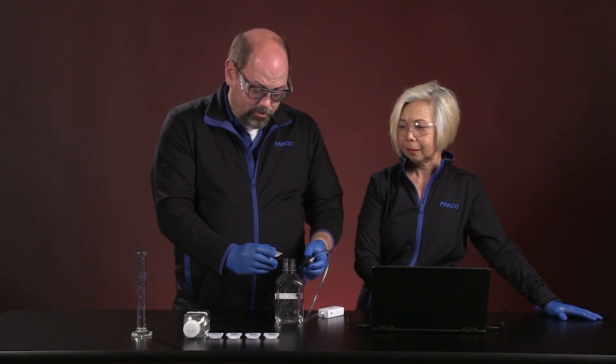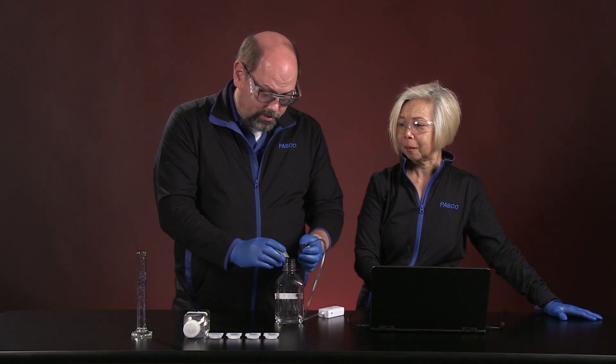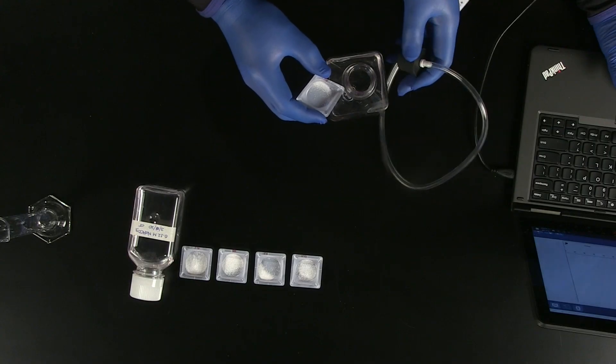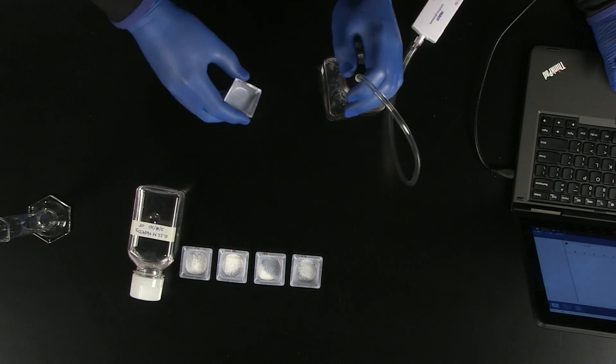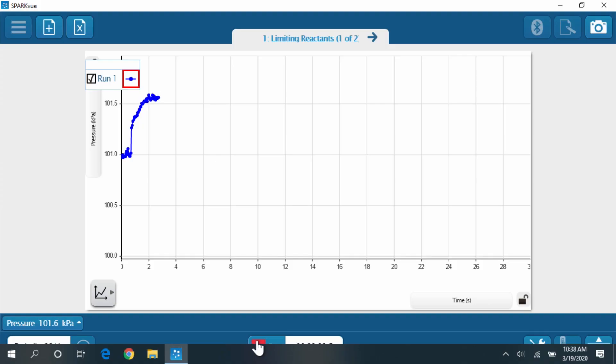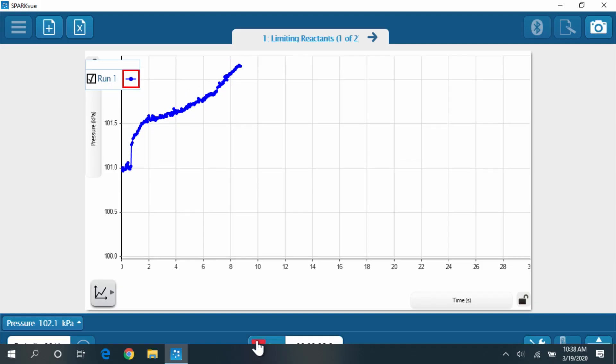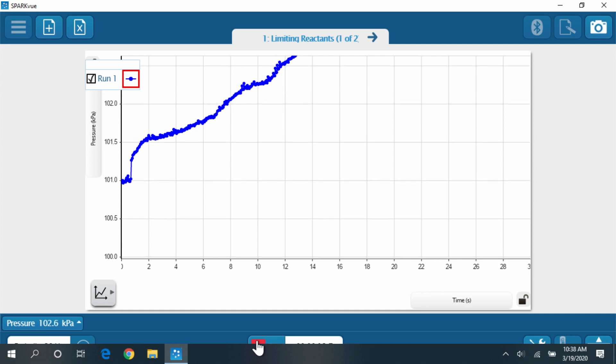Here we go. I'm going to pour this in and then cap it off as quickly as I can. I'm going to give it a little bit of a flick to get all this material into this sodium bicarbonate. One, two, three. There we go. And swirl it around just a little bit. Oh, you can already see that gas is being produced. And that is indicated by the change in pressure.